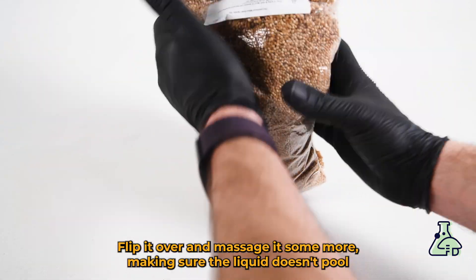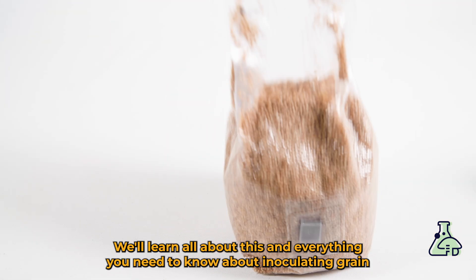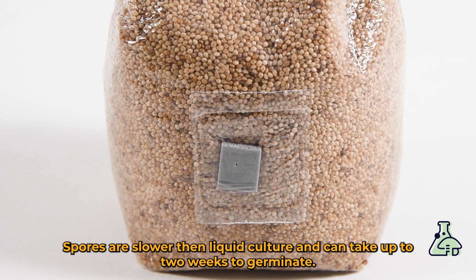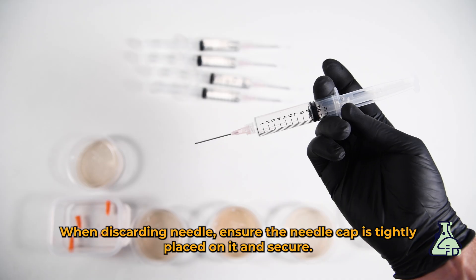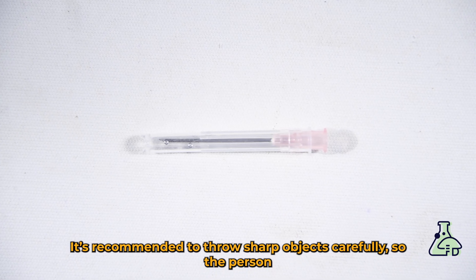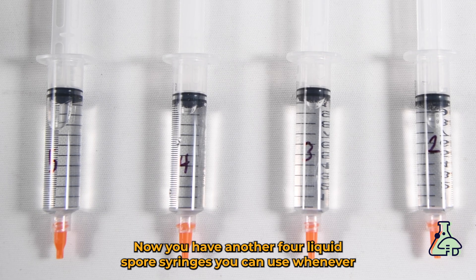Flip it over and massage it some more, making sure the liquid doesn't pool onto the bottom. We'll learn all about inoculating grain in another skill video. Spores are slower than liquid culture and can take up to two weeks to germinate. When working with needles, be careful not to pierce yourself or others. When discarding the needle, make sure the cap is tightly placed on it. It's recommended to throw away the sharp object carefully so the person emptying the bin doesn't get pierced. Now you have another four liquid spore syringes you can use whenever you want.